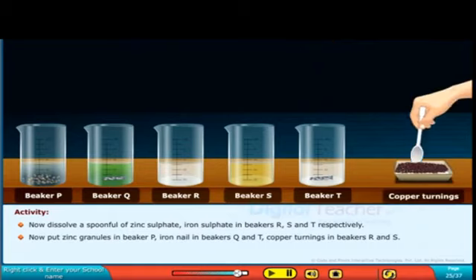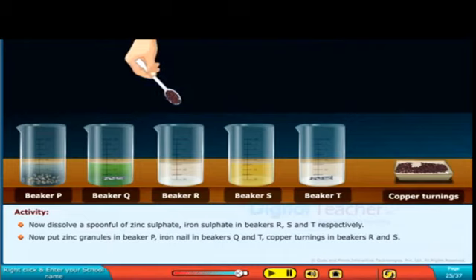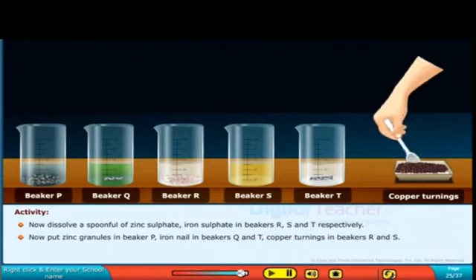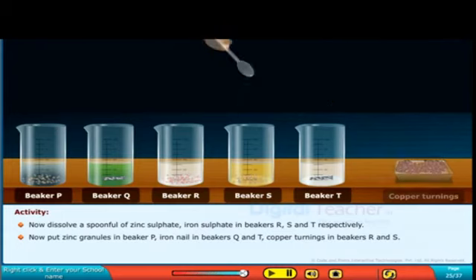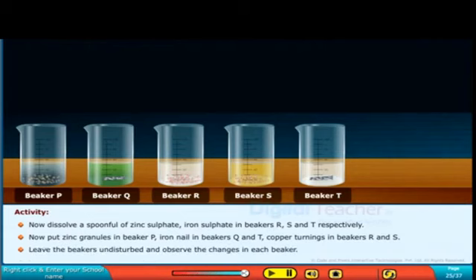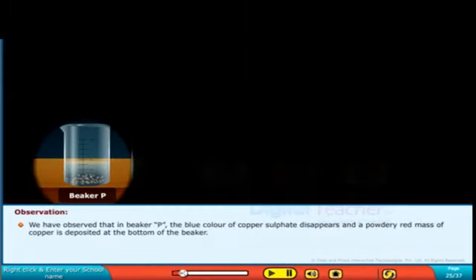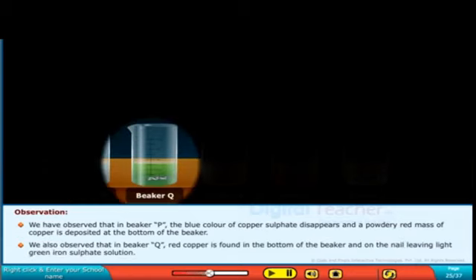Next, we put zinc granules in beaker P, and an iron nail in beakers Q and T, and copper turnings in beakers R and S. Leave the beakers undisturbed and observe the change. In beaker P, the blue colour of copper sulphate disappears and a powdery red mass of copper is deposited at the bottom. In beaker Q, red copper is found at the bottom and on the nail, leaving a light green iron sulphate solution.